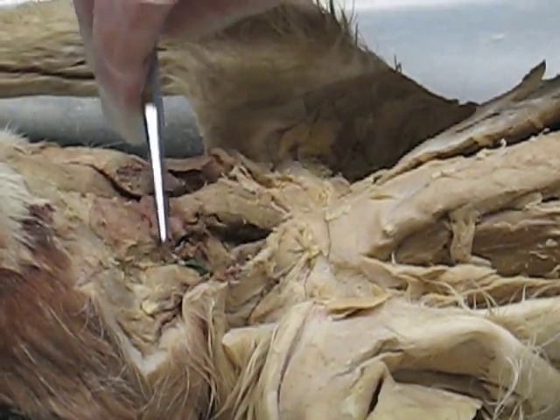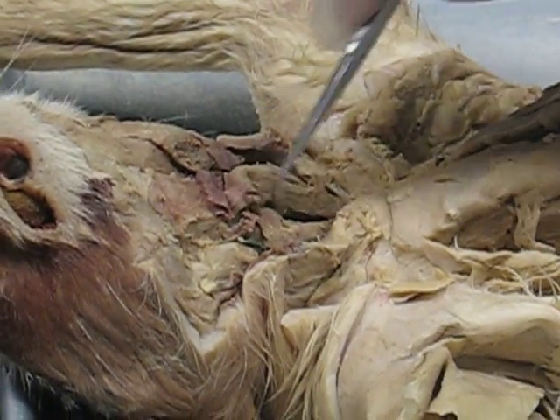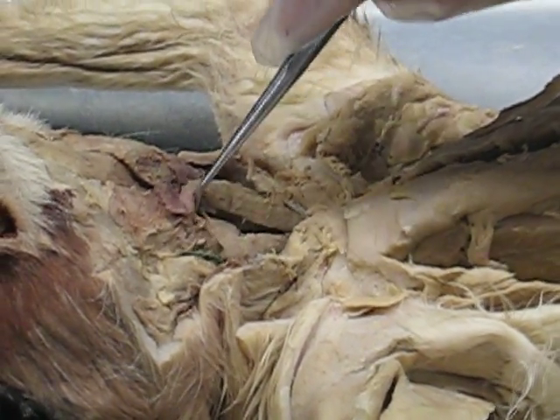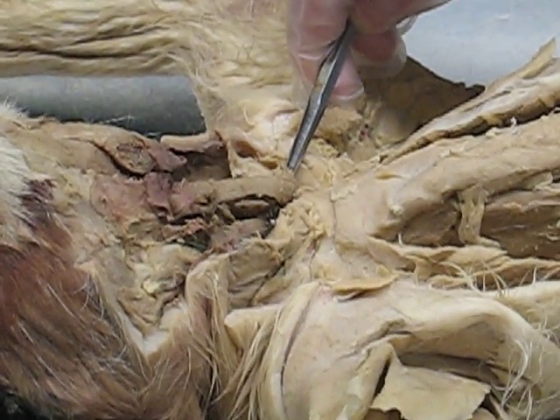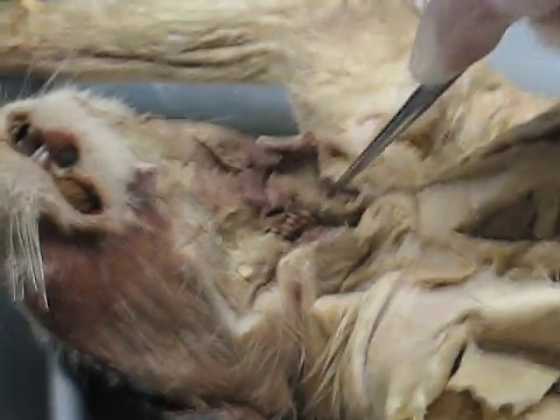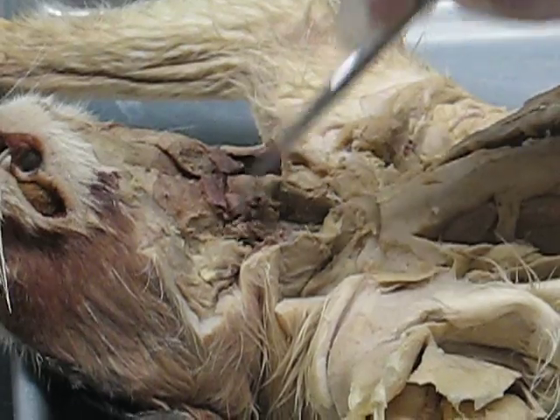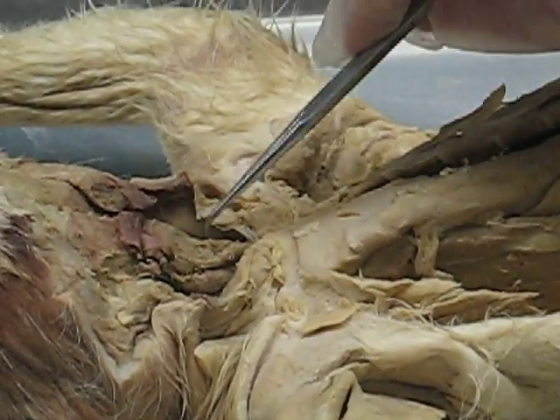The sternohyoid runs from the sternum to the hyoid bone. On the side of it, you have the sternothyroid — it's attached to the larynx. Here's the larynx. Here's the trachea. So the sternothyroid is attached to the thyroid cartilage of the larynx. Next to that, you have the thyrohyoid. The sternohyoid goes from the sternum to the hyoid bone; the sternothyroid is on the side, on both sides. Here it is on the other side, and here it is on this side. The little flap here is the thyrohyoid — the little tiny thing right here, this little loop.